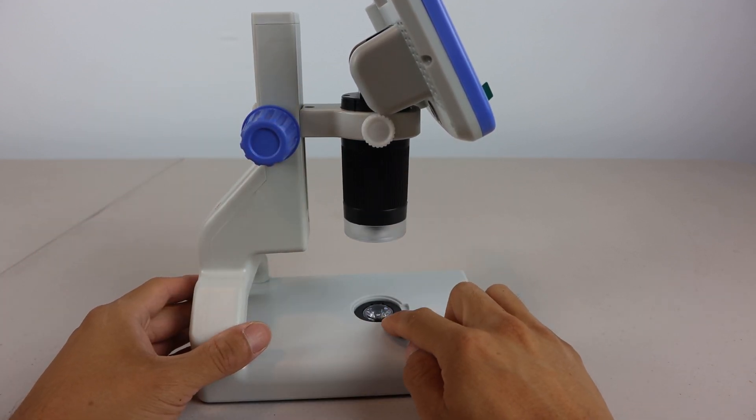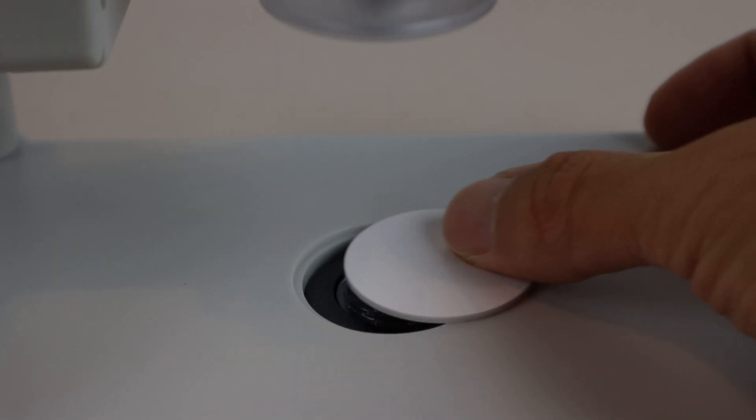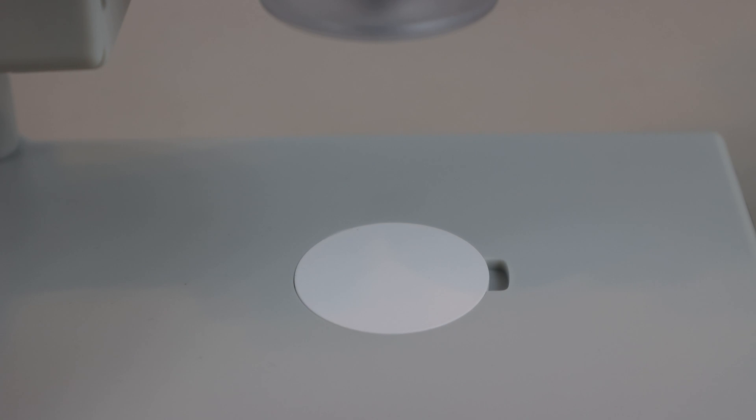Directly below the lens is the LED light source, which you can use with any of the three light filters to produce different images when viewing your slides.